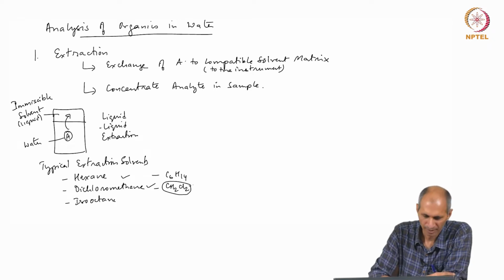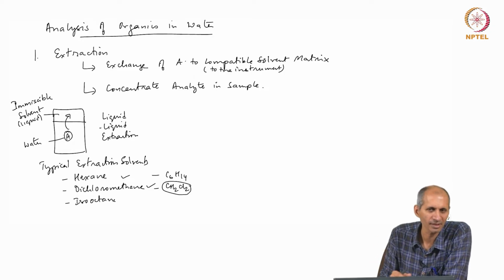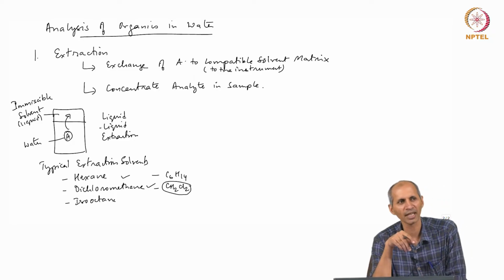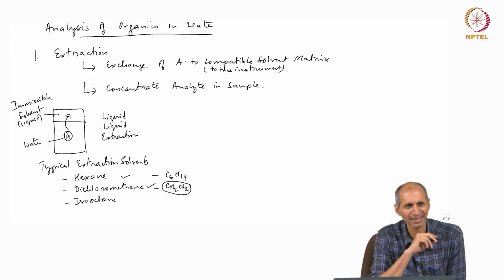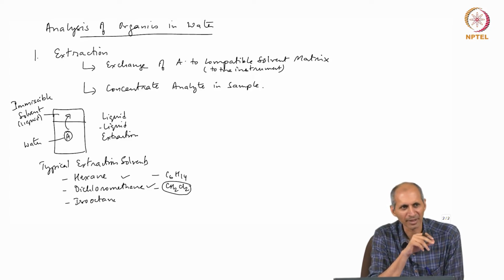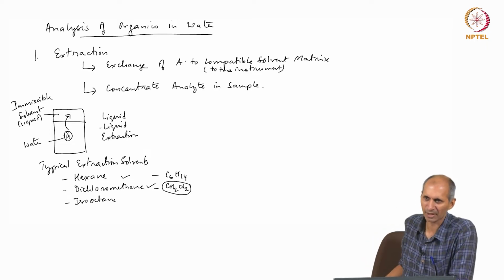For this kind of extraction, we are not using large quantities, we are using small quantities, and that is why you have a section in your analysis method called waste management, which means at the end of your extraction, you will have some dichloromethane or hexane, and you can't throw it down the drain. You have to dispose of it properly. So, this is one point at which you have to do method selection properly. You are introducing a hazardous chemical here.